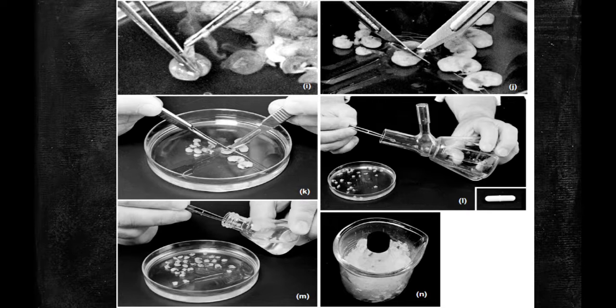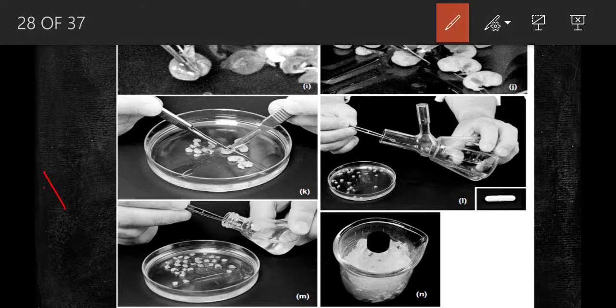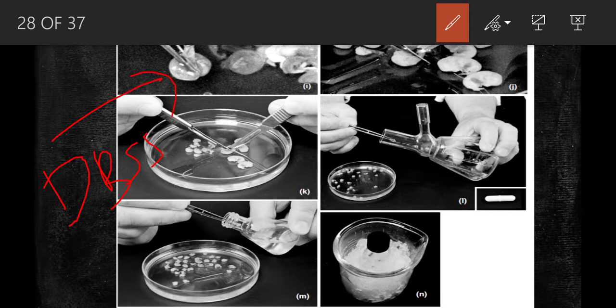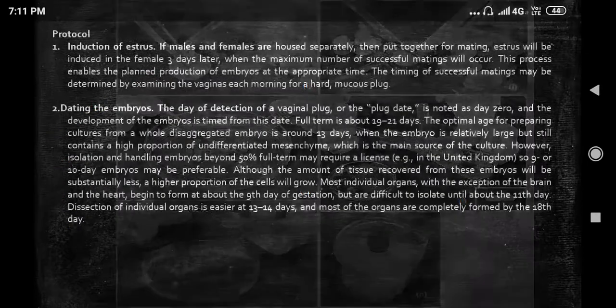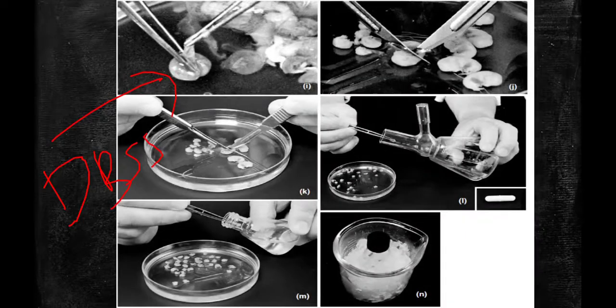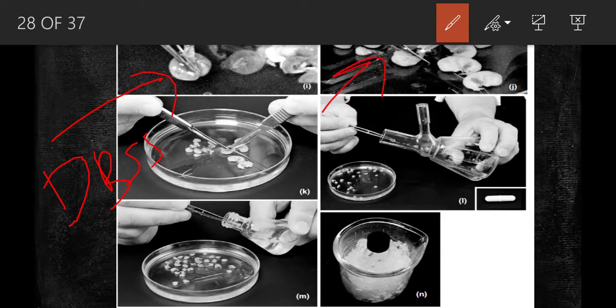Transfer them into the petri dish which contains sterile DBSS medium. You have to dissect out the embryos. While dissecting, there are two steps: first, tear out the uterus with two pairs of sterile forceps.